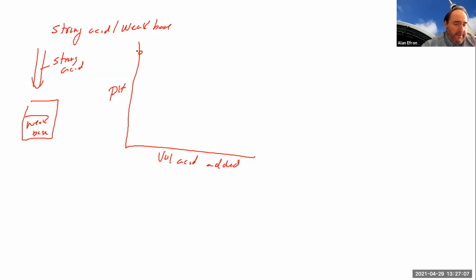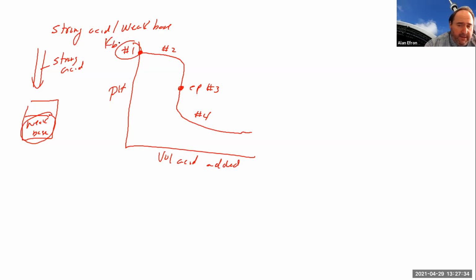And because we're starting with a weak base, we're actually going to start up with a high pH, right? Because we're basically starting with a base. And what we see on this one is the curve kind of goes the opposite way, very badly drawn, but we kind of come down and around in terms of pH, equivalence point somewhere here. But even though it's sort of upside down, it's really the same exact 4 spots as the previous one we just talked about. The difference is we're just dealing with some base here. So again, this would be a Kb problem, right? A weak base problem where actually you would do an ice table with molarity. You would solve for X. It would be the hydroxide concentration, getting you your pOH and then to your pH.